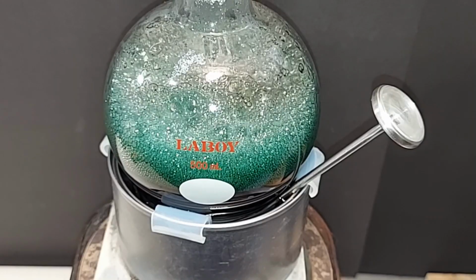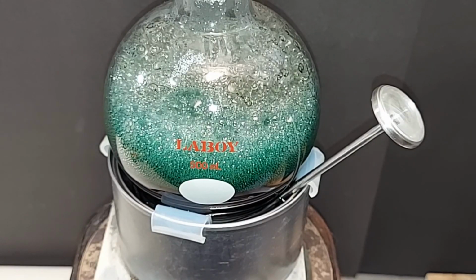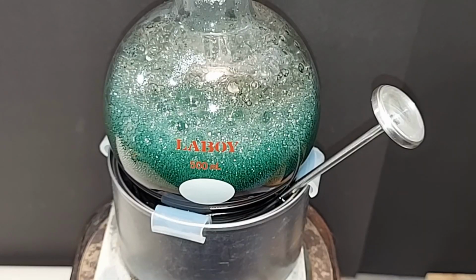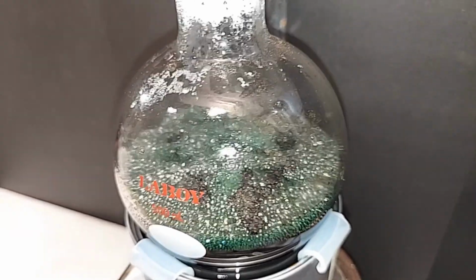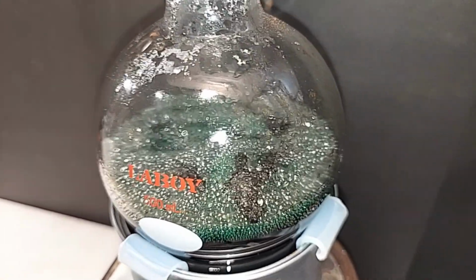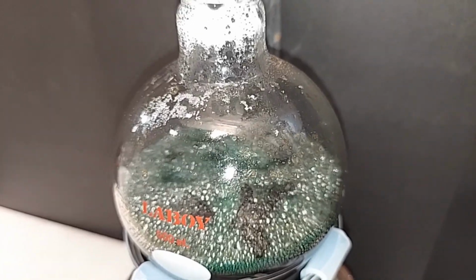I turned it down. The oil has quite a bit of heat capacitance, so it's not going to drop as quick as if it was just on a red hot burner or something. So yeah, just something to note. Well, the foaming has subsided. I turned it down, like I said earlier, and then when I turned it back up, it just didn't foam as much, so I'll take it.